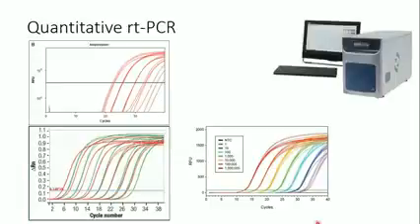These are amplification curves for the same sample, applied in several tubes to ensure the result.